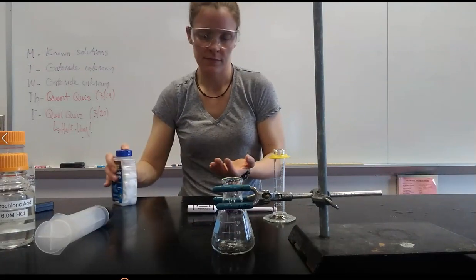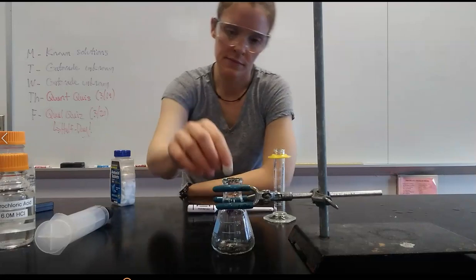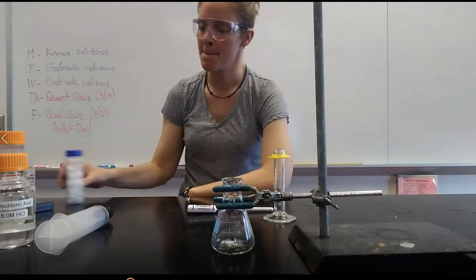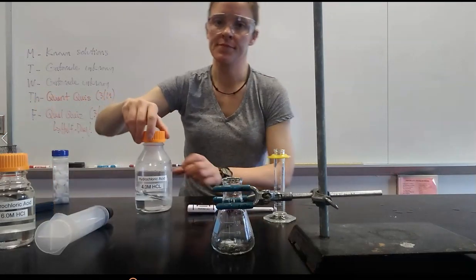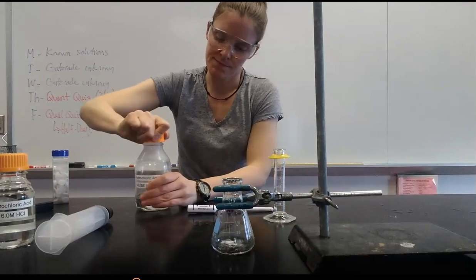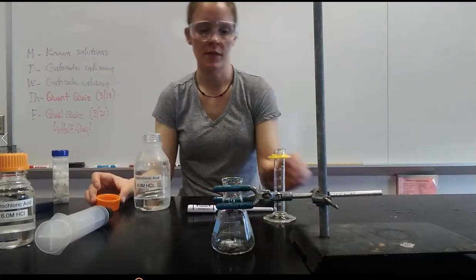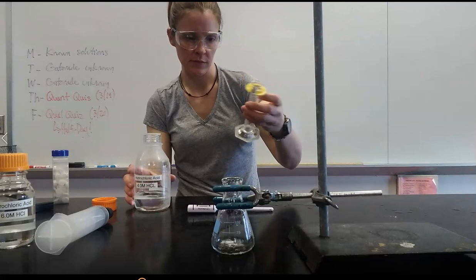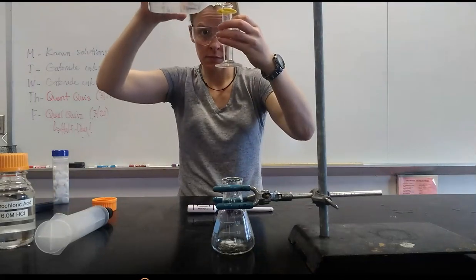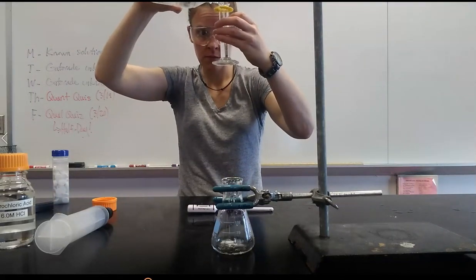That's a gas collection syringe and we're going to use that to collect the gas. I'm going to add a tablet. I don't need to weigh it because I know the mass of active ingredient. It's 0.500 grams of calcium carbonate and I'll use the 4.0 molar solution of HCl. You're going to need about 15 milliliters. Don't go crazy making sure that it's exact but be pretty consistent.